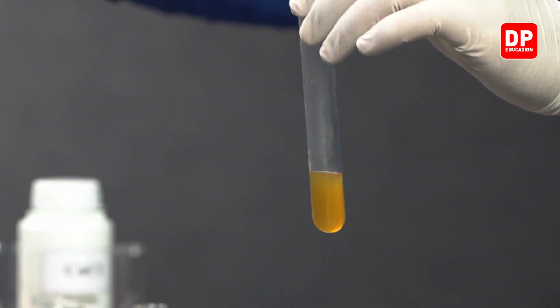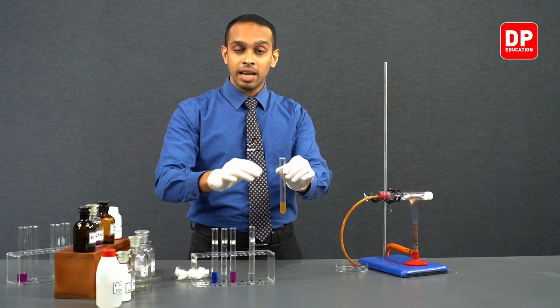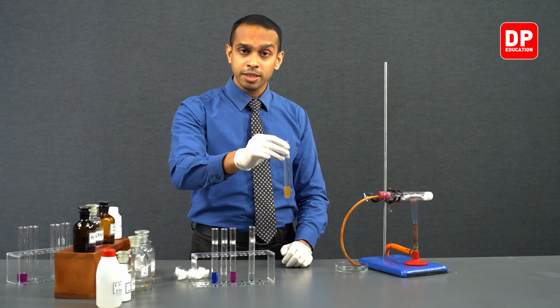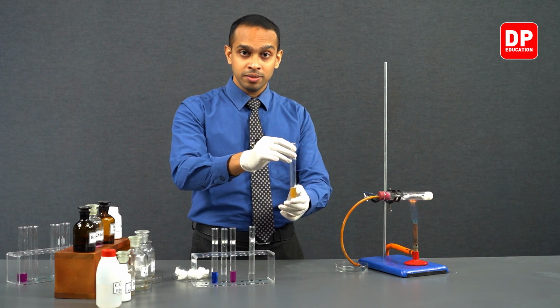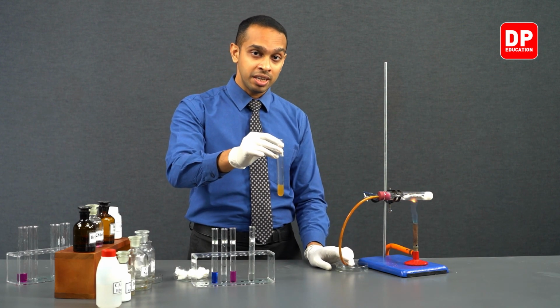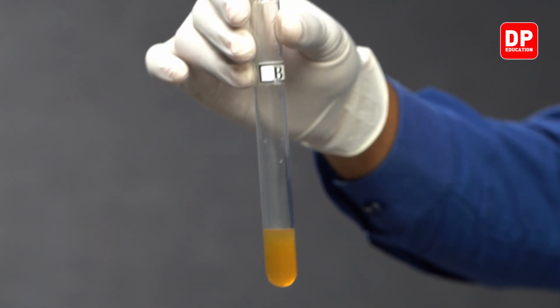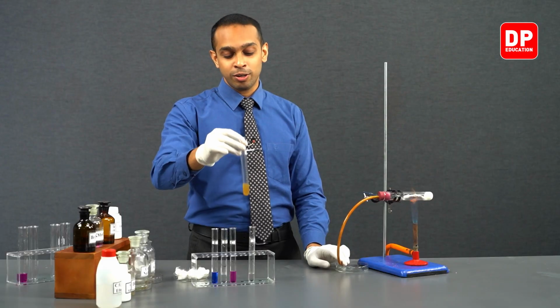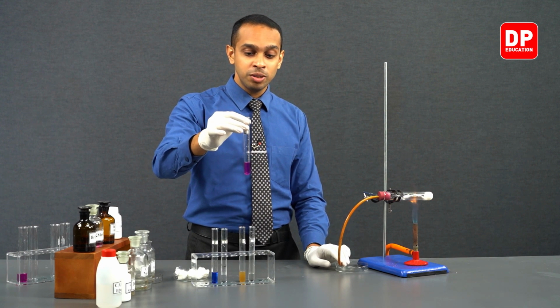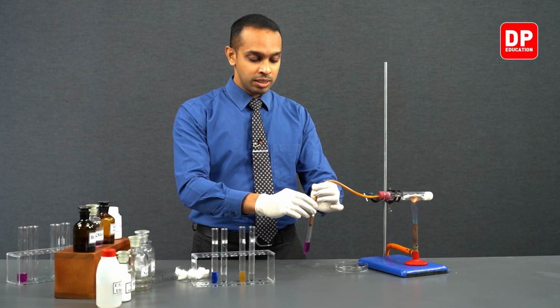We started off with a purple solution. Alkaline potassium permanganate was a purple solution. Then later on, when we introduced ethene, what happened? It turned this potassium permanganate into potassium manganate, which was a green solution, and then to this brown suspension, which is due to the formation of MnO2 or manganese dioxide. Now we are going to introduce this gas that is formed into acidified potassium permanganate.